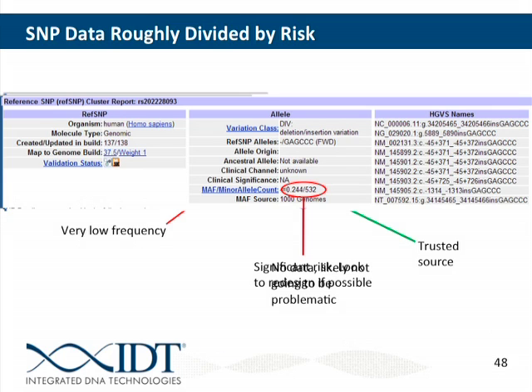Then here's one that's reported at 0.244 allelic frequency. This is something you would want to avoid. It poses a significant risk, and look to redesign it if possible. So then I would probably go back to PrimerQuest, select the second assay on the list, and repeat the blasting and SNP checking with that second assay. And so you continue that process until you find one that is highly specific by BLAST and has no SNPs with a significant allelic frequency in either your primers or probes.